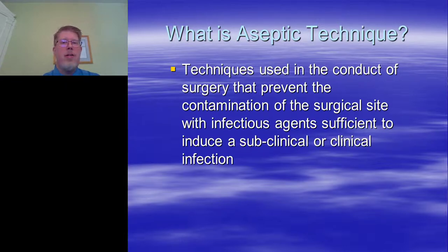If you have a subclinical infection that, because of a breach in the dura, because you've done brain surgery, crosses into the brain, you have transient lesions which fibrose afterwards. This isn't a maybe. This is almost a certainty. Again, that is going to change your data. That is going to change your results. Aseptic technique is critical. We do it in humans. All of our lab animals that we typically do surgery on are mammals too, and they get infected just the same way.